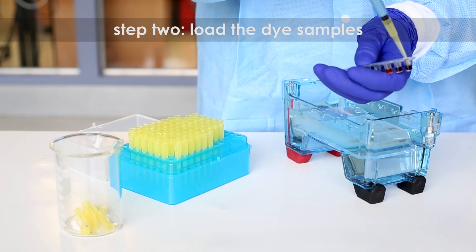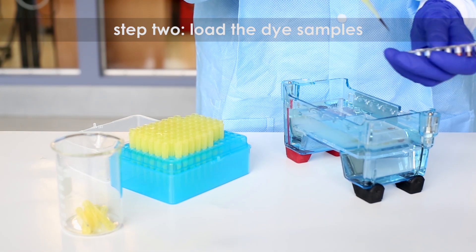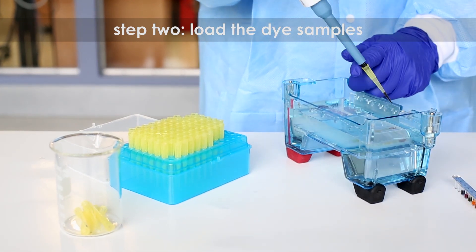Step two: load 35 to 38 microliters of the dye samples into wells in consecutive order starting with the positive web.